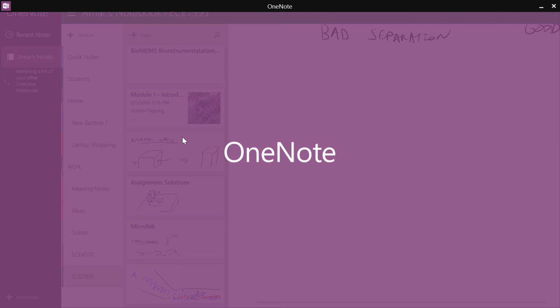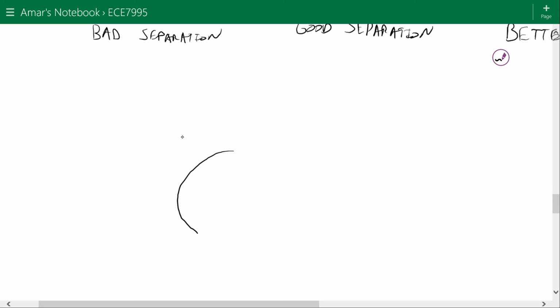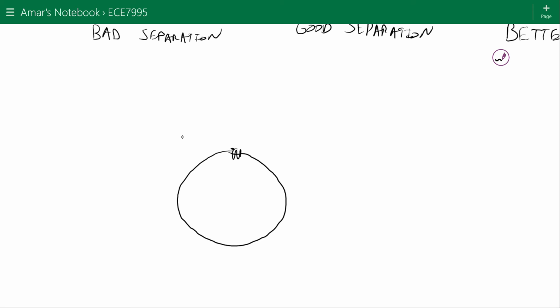but I'm just going to put up a really rough diagram here. A cell might have different surface proteins on it. A cell has these different proteins on the surface. I'm just going to draw them like this. So this would be the cell membrane. This would be a membrane protein.